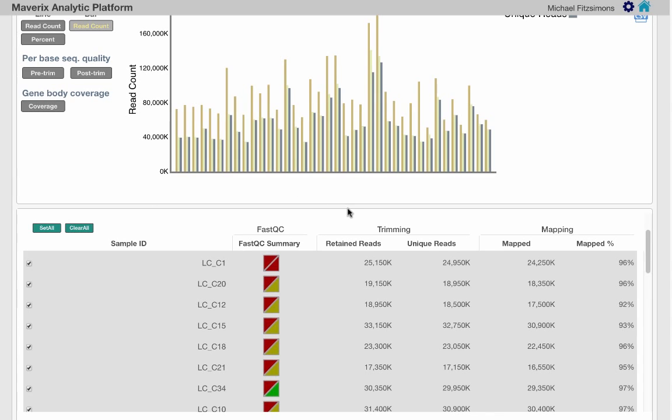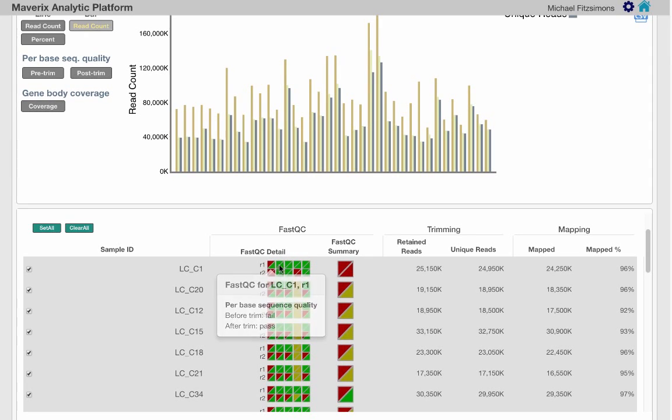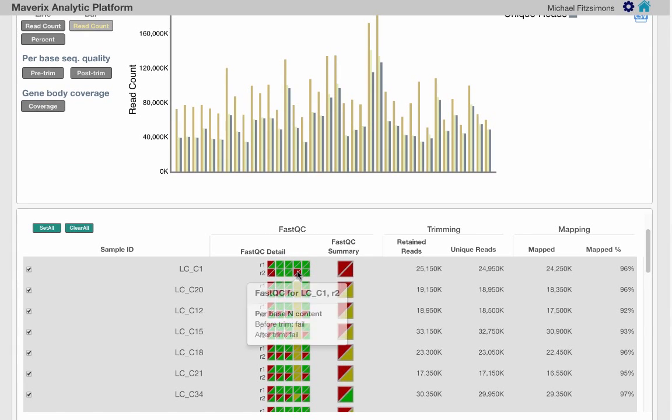The first area consists of FastQC results. If you would like to dig more deeply into any of these results, raw output files can be downloaded from within the file download area of the platform.